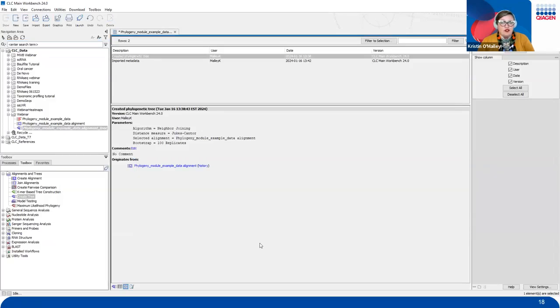You have the ability to do that as well. Okay. And so we had a question: can we add different sequence files and then do an alignment for all at once, or do we have to upload one file at a time?